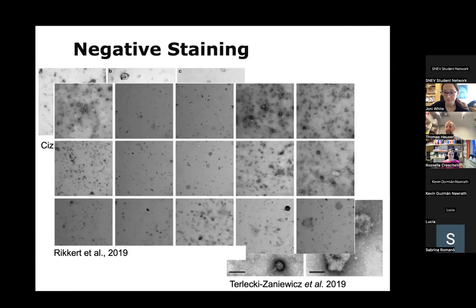So there's many different ways how you can do negative stain. I described, we take our grid, put a drop on top of it. I've also done it exactly like you described, where you have your parafilm drops and then put the grid on top of this. I would not expect tremendous differences.